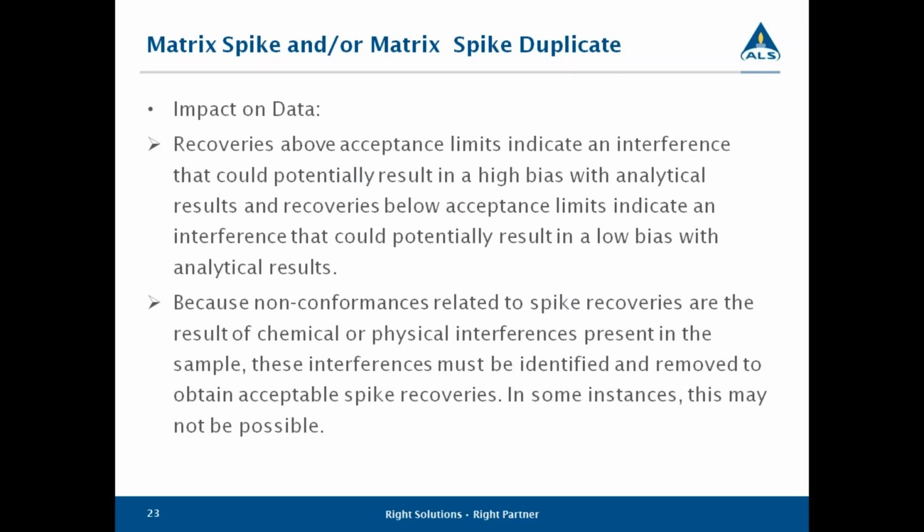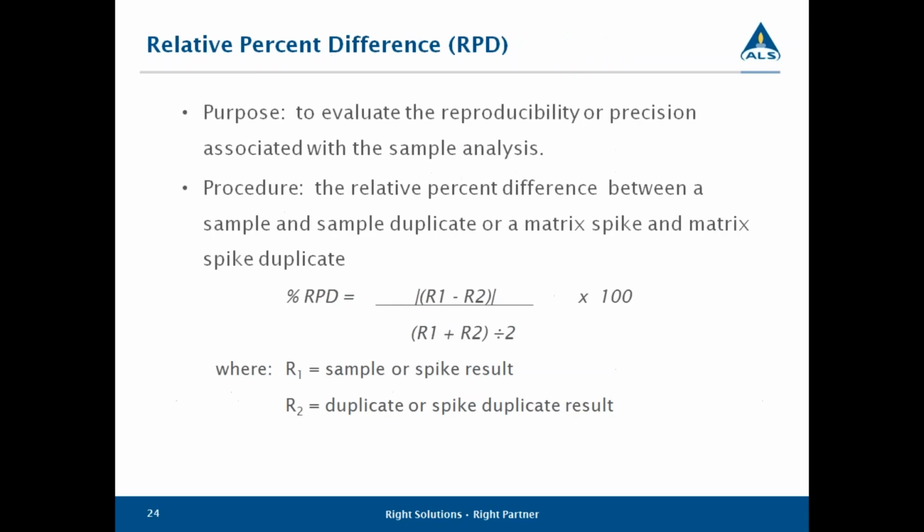Whatever laboratories you all are using, I would recommend very highly a very useful tool. If you're not asking your laboratory to take one of your samples and specify a matrix spike on it, you should really do it. Very, very good tool. So useful. It really gives you a lot of peace of mind, I think, which is why it's my favorite quality control criteria. Right, Vicki? It is. It's great.